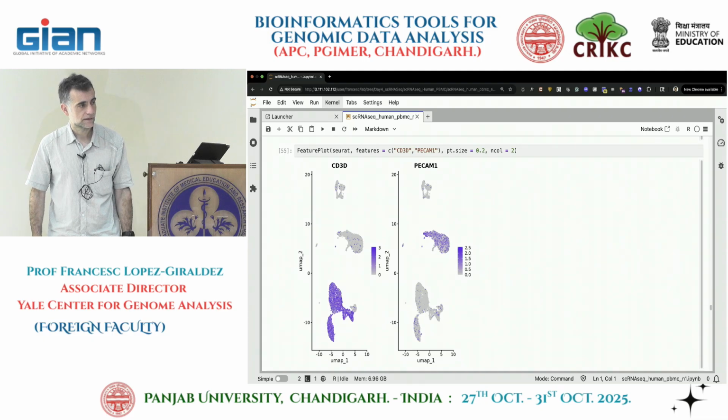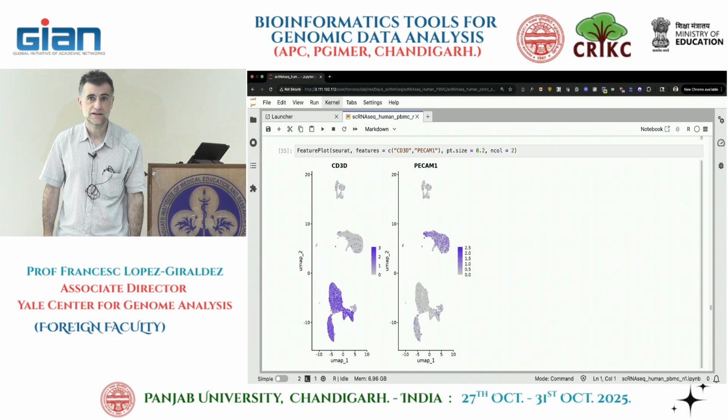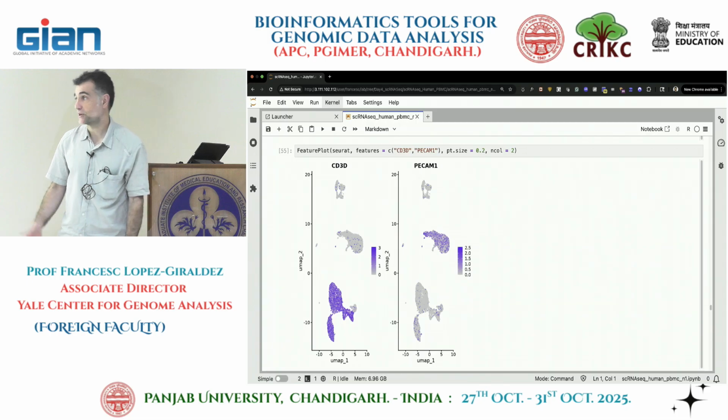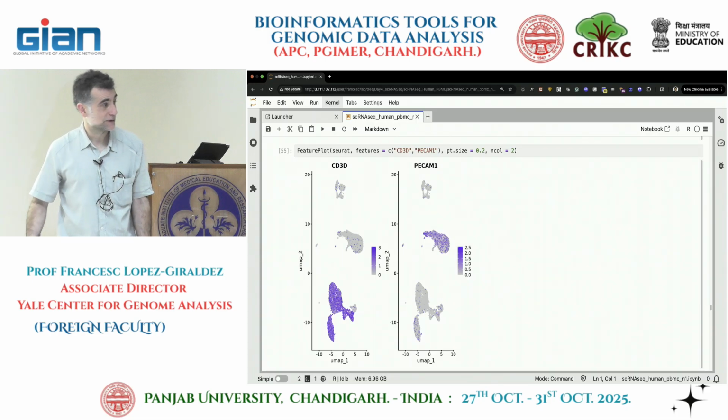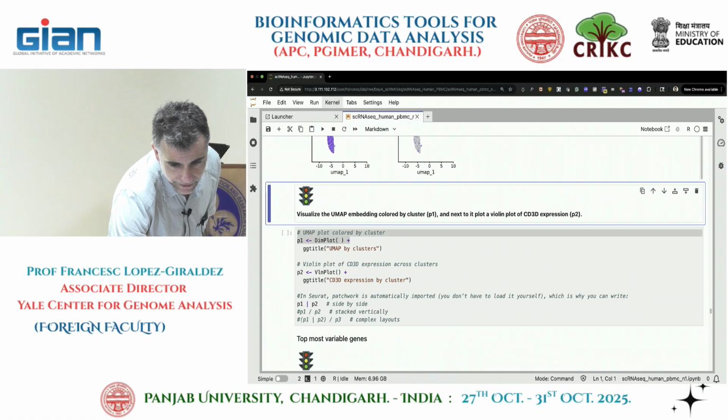This is C3D. Yep. Actually C3. CD3D. T cells? T cells. It's a co-receptor for T cells. Okay. So you have delta, you have epsilon. That's what I thought it was. Here we have it. So maybe there are T cells. Epsilon is okay.